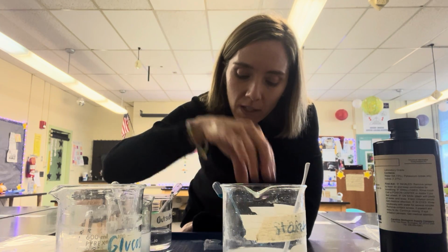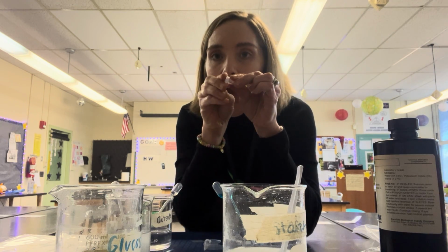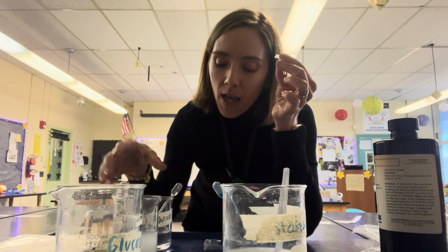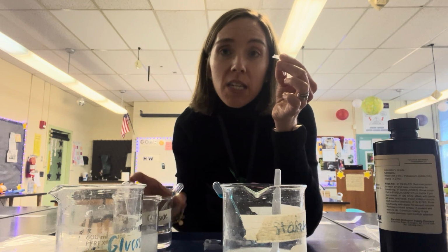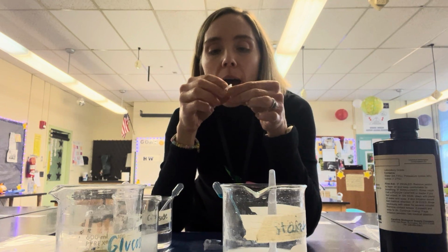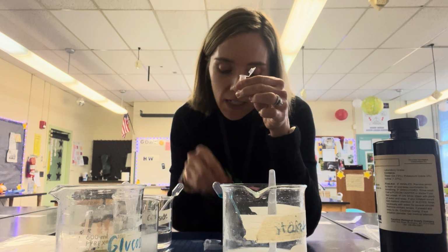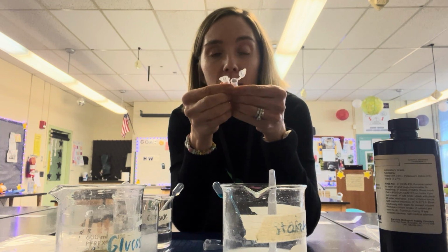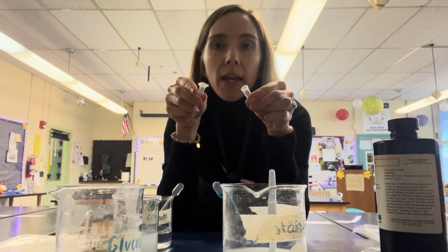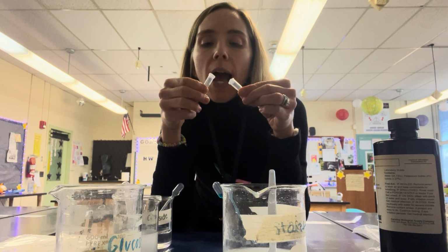So in the lab, we set up some microcentrifuge tubes, which are these little tubes that have caps, to test the liquid both from inside the tubing and outside the beaker to see what stayed in the tube and to see what made it through. We labeled them with letters. IB would be the inside of the tube tested with Benedict's. II would be the inside of the tube tested with iodine, and then OB and OI, outside Benedict's and outside iodine. We're going to start with the test for outside.